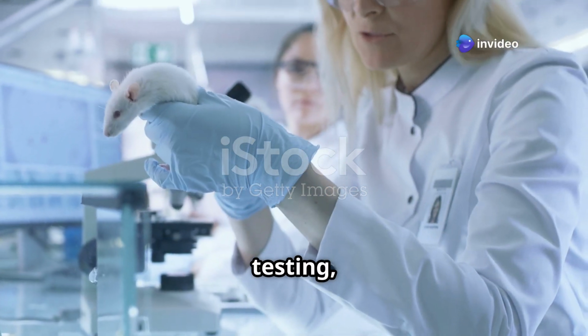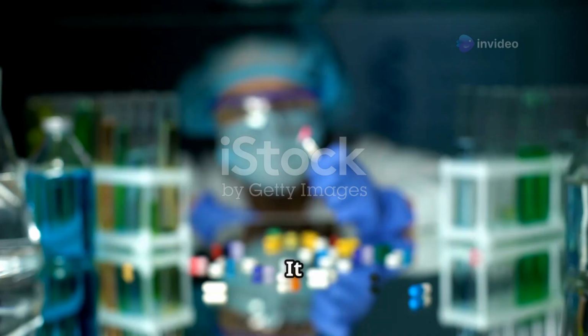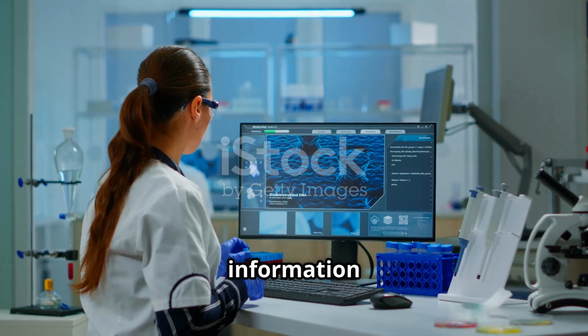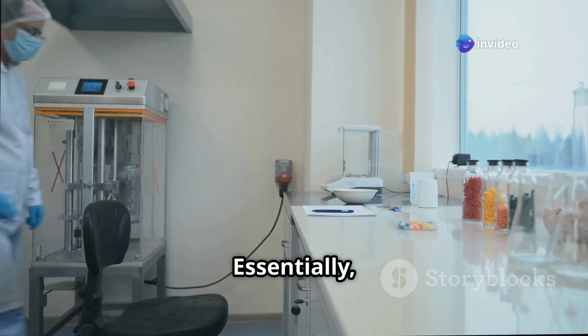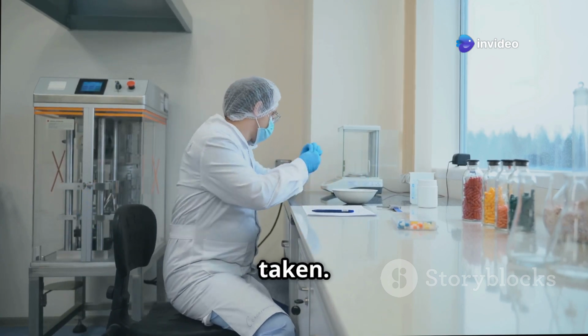In-vitro release testing, or IVRT, is a crucial step in pharmaceutical development. It helps us understand how a drug is released from its dosage form. This information is vital for ensuring the drug's effectiveness and safety. Essentially, IVRT mimics what happens to a drug inside the human body after it's taken.